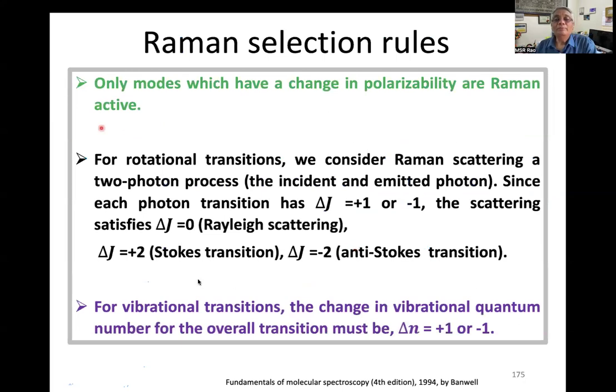Now, what are the Raman selection rules? Only modes which have a change in polarizability are Raman active. Always remember this. This is one of the basic principles of how Raman modes can appear. Only modes which have a change in polarizability are Raman active.